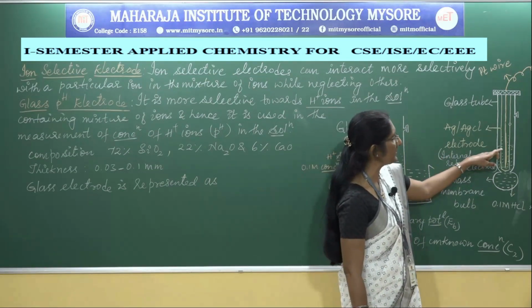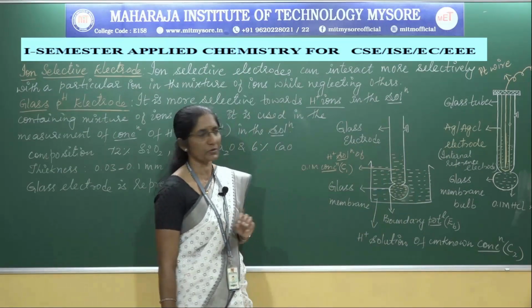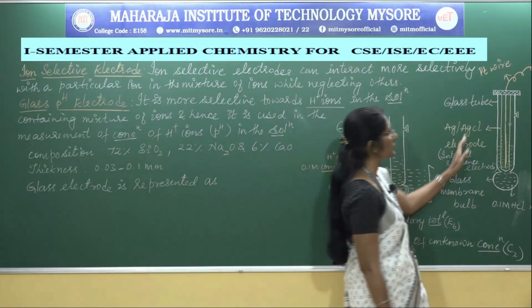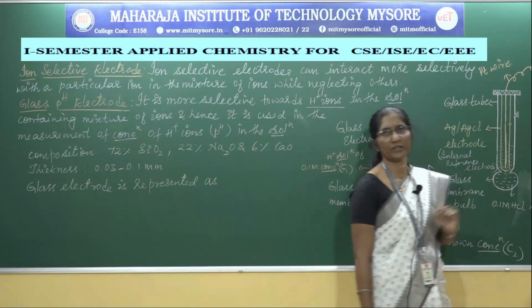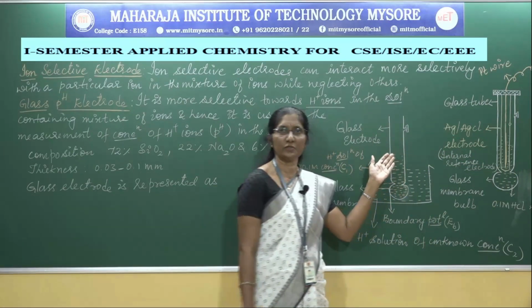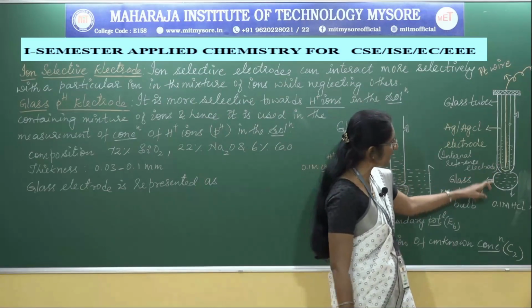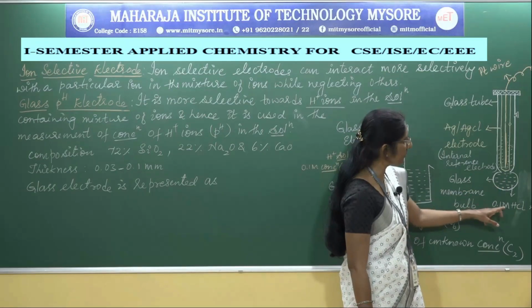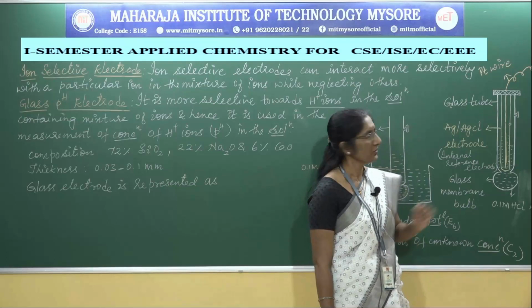Its role is to measure the membrane potential, and to couple this electrode with other electrodes, that is, for electrical contact. The glass bulb is filled with 0.1 molar HCl solution or a known buffer solution.